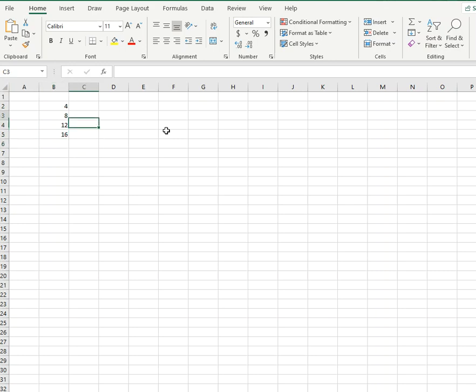And then the directions tell me to match that with the density value. So I'm just going to make these up, all right? So I'm going to do like 1.02, and then 1.04, and then 1.06, and then 1.08. All right? I don't know. You might not get those values, and if not, that's okay. You use what you obtained in the lab.